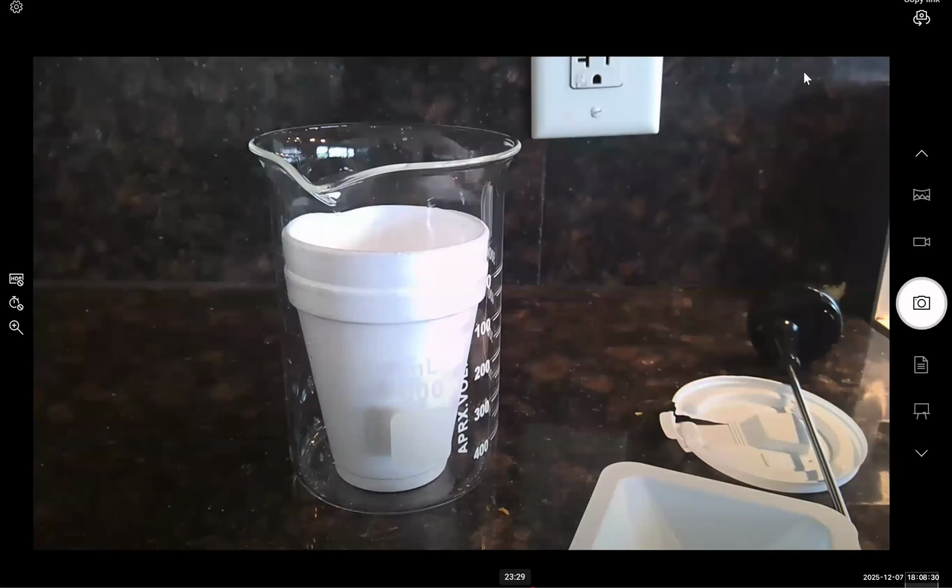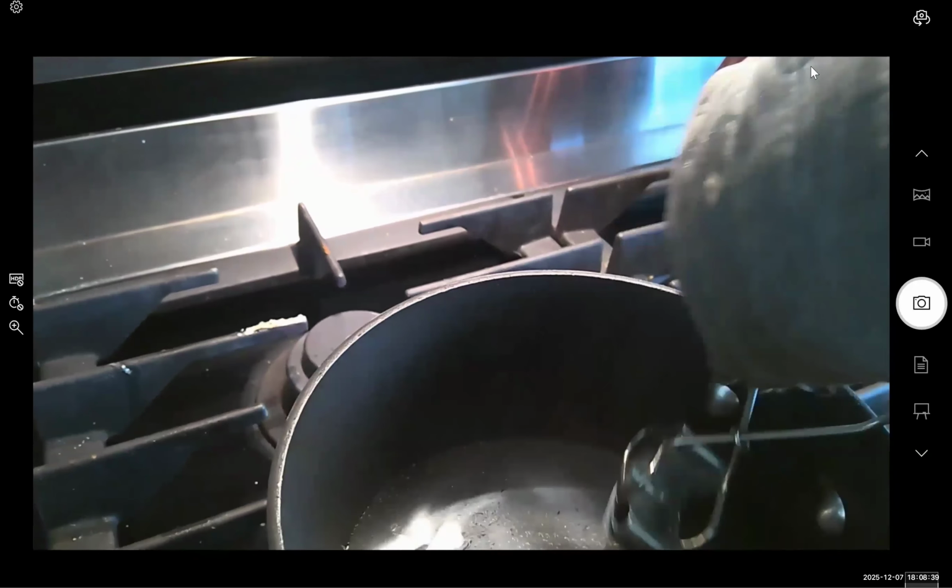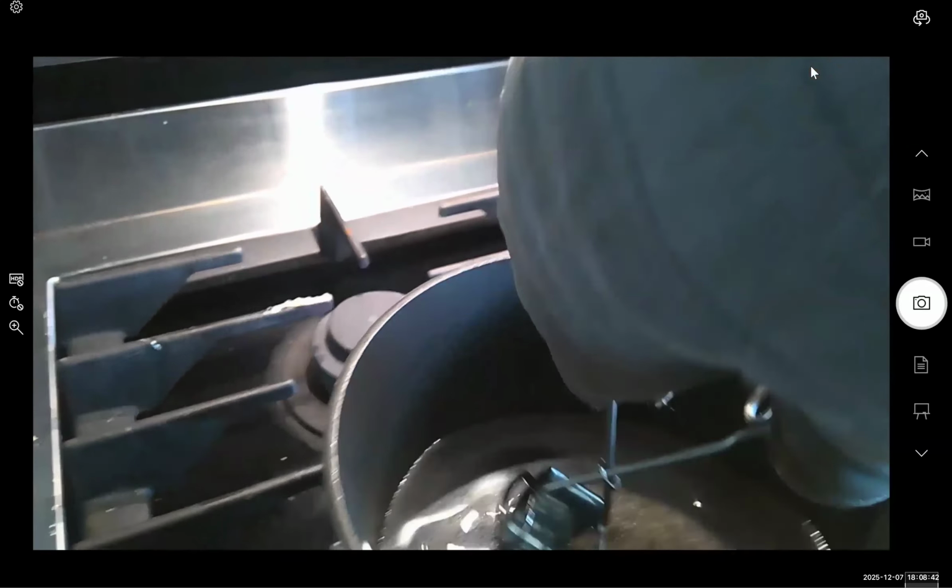One moment. So we took the metal piece and we heated the metal piece in the boiling water bath. We're now ready to transfer that metal piece.